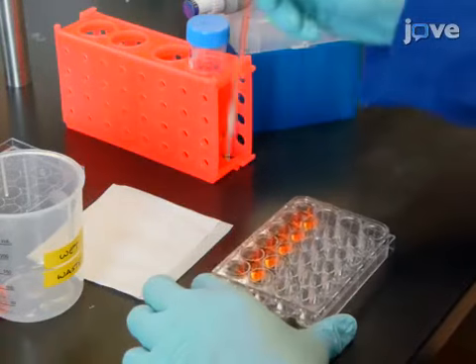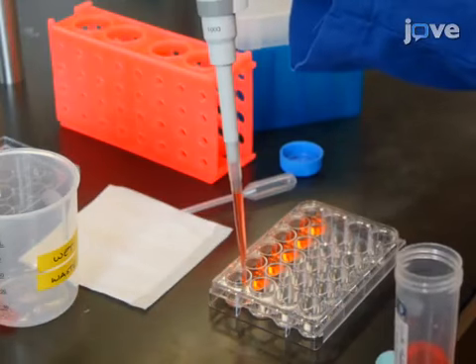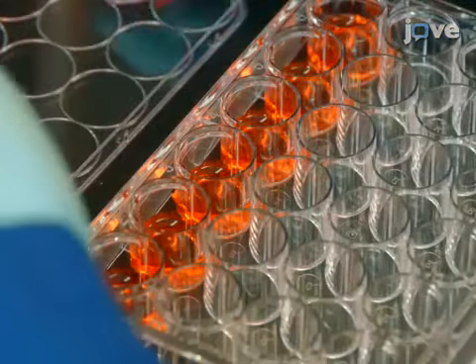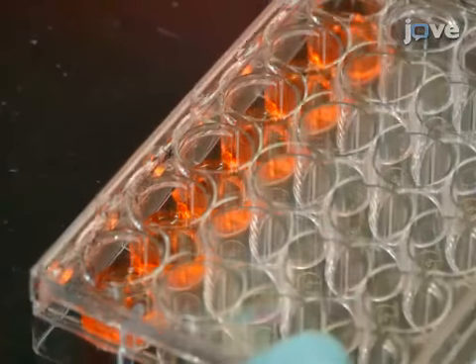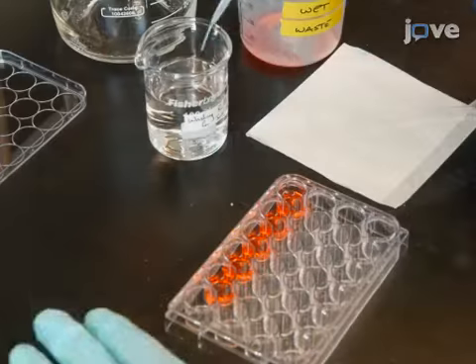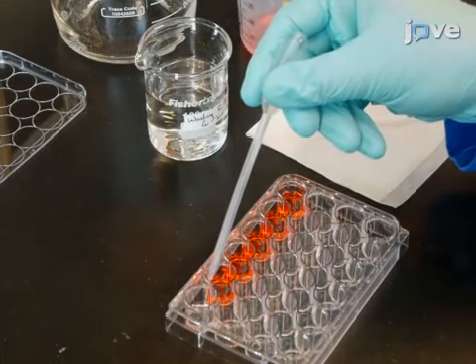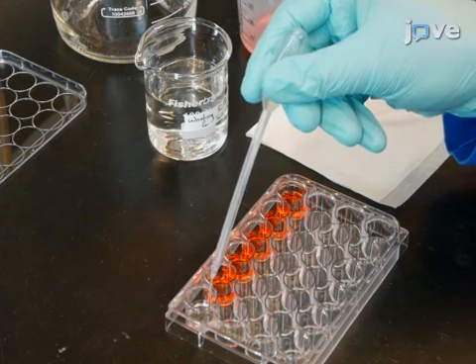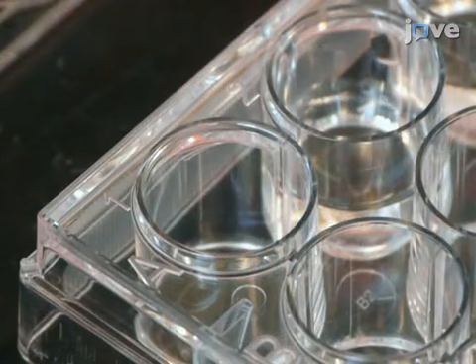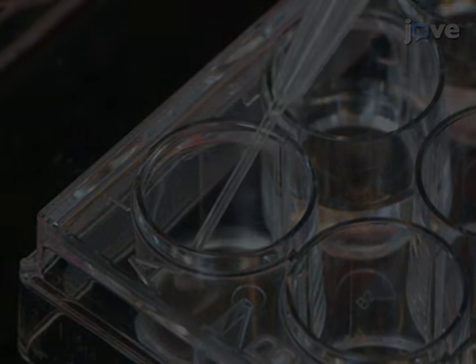To begin this procedure, remove the original growth medium and replace it with medium containing the drug of interest at the chosen concentration. Next, incubate the cells in the original growth conditions for the chosen treatment duration. After incubation, wash the cells gently with 1 ml of washing buffer each time for 3 times. Fix the cells with 300 microliters of 4% paraformaldehyde in 0.1 molar PBS for 10 minutes.